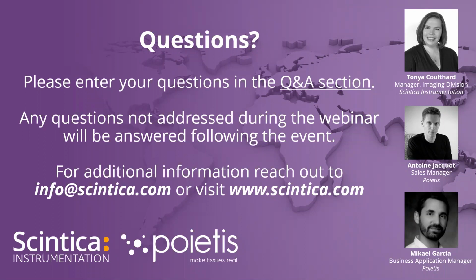Another question, is there any need for any type of polymerization, sorry, I'm having trouble with that word today, printing such as UV light? I can take a stab at this answer first. There is the option, if you're using something that needs to be UV cross-linked or polymerized, for a UV multi-wavelength device to be integrated into the system, so that the robotic arm would simply take the matrix that you're printing onto over, and it can do that UV exposure if needed.